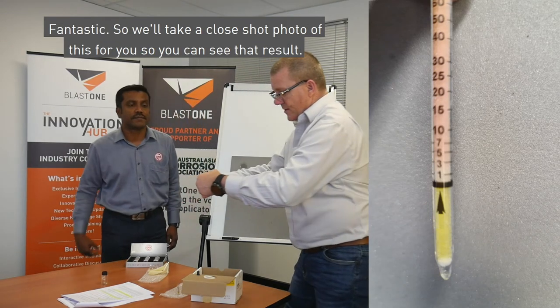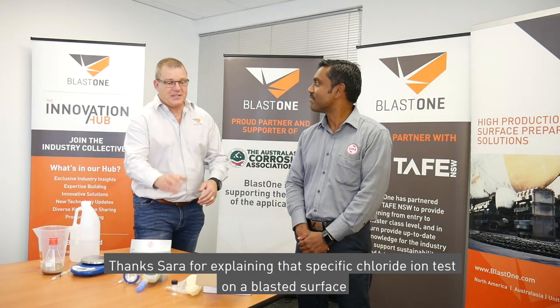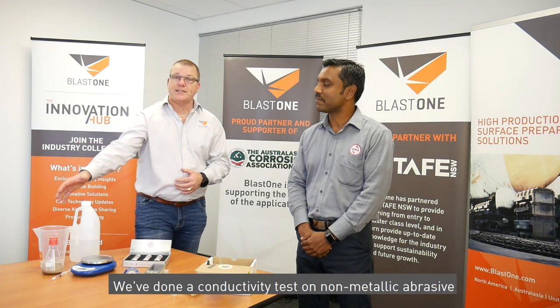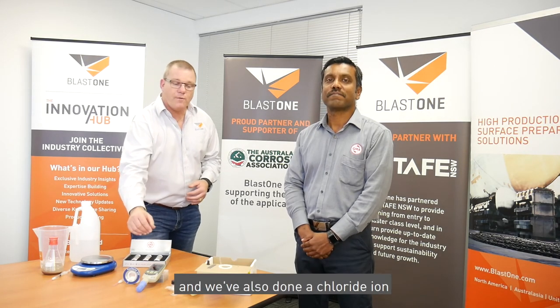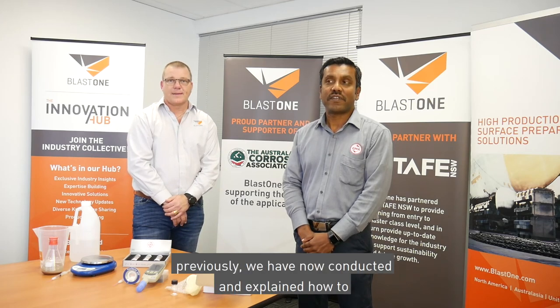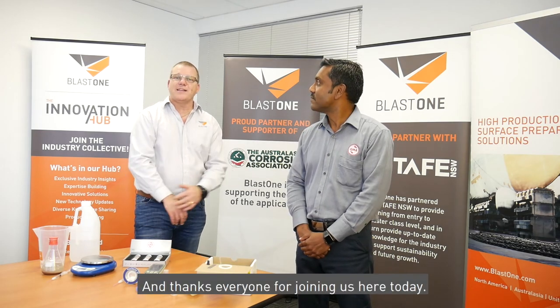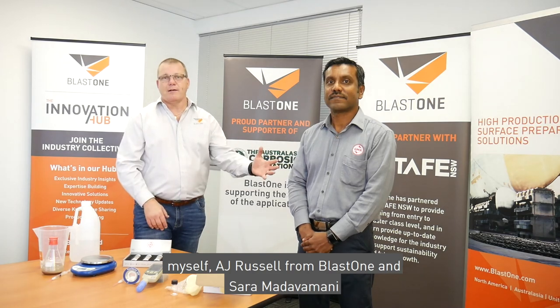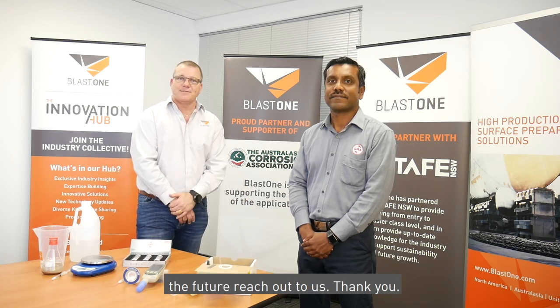The result shows as three parts per million, or 3 ppm. Fantastic — we'll take a close-up photo of this so you can see that result. Thanks Sara for explaining that specific chloride ion test on a blasted surface. Thanks everyone for joining us today: we've done a conductivity test on a non-metallic abrasive, a conductivity measurement of blasted surfaces, and a chloride ion specific test on a blasted surface. As explained by Craig and Julian previously, we have now conducted and explained how to do specific corrosion salt testing. Thanks everyone — I hope you really got something out of these insights. By myself AJ Russell from BLAST1 and Sara Madhavami from GMA Garnet — more than happy to take any questions, or reach out to us in the future. Thank you, bye.